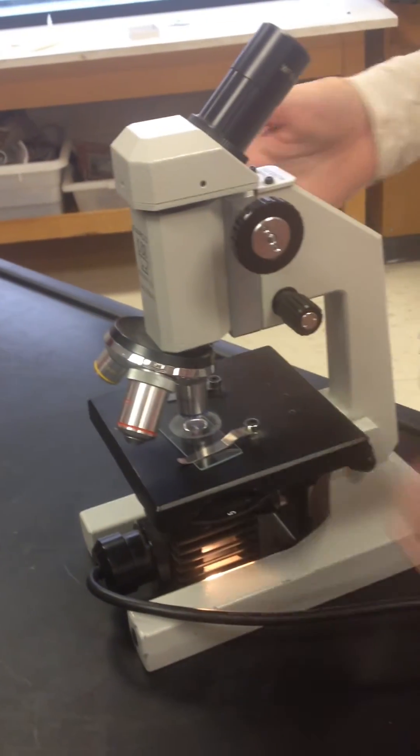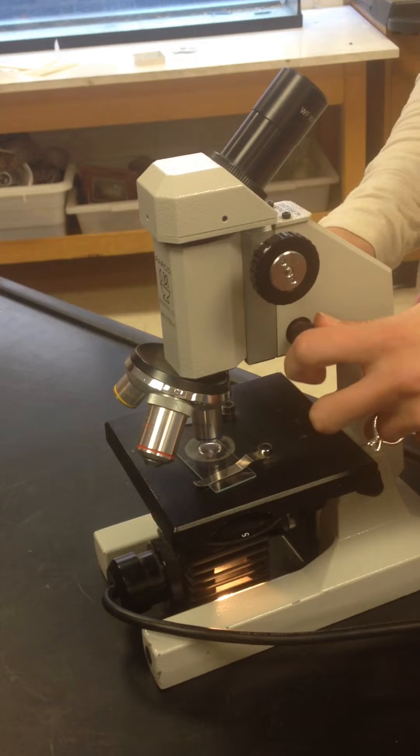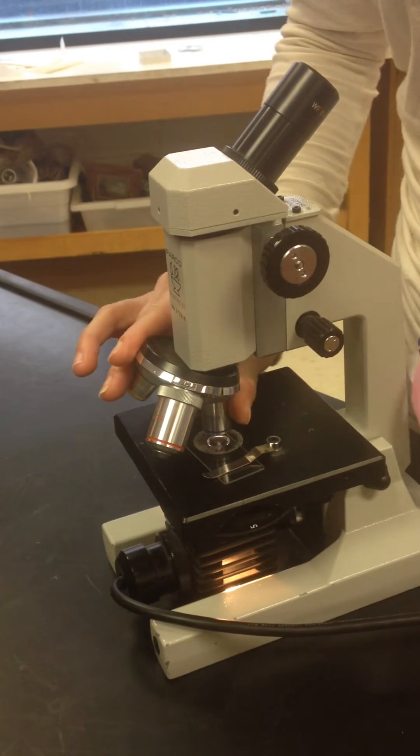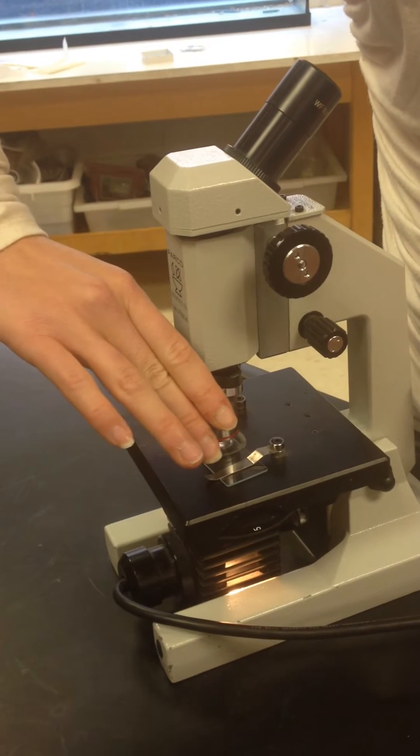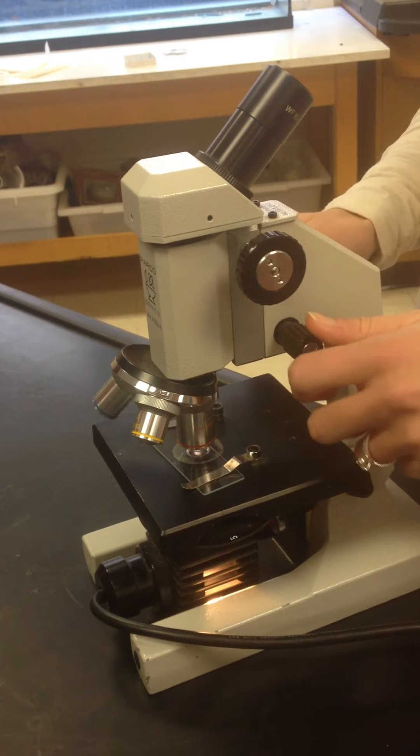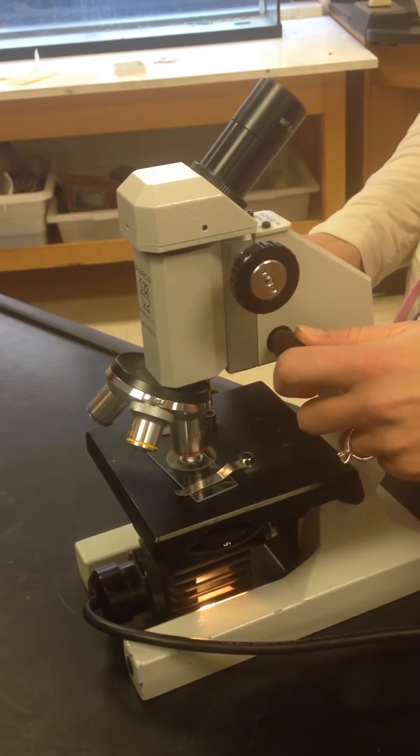You then are going to only use the fine adjustment knob to bring it in and out of focus until it's in perfect focus and then rotate once again up to high power. Once it's in high power, you then again can make those last fine-tuned adjustments with the fine adjustment knob.